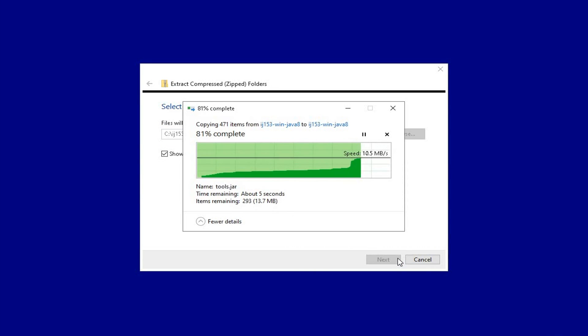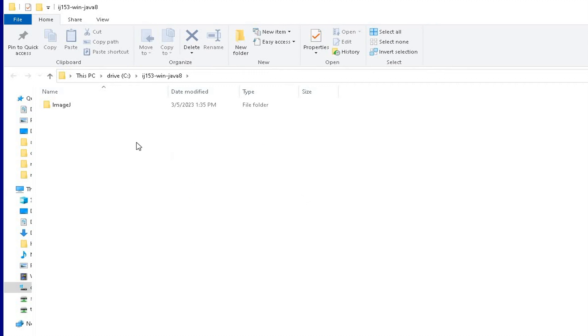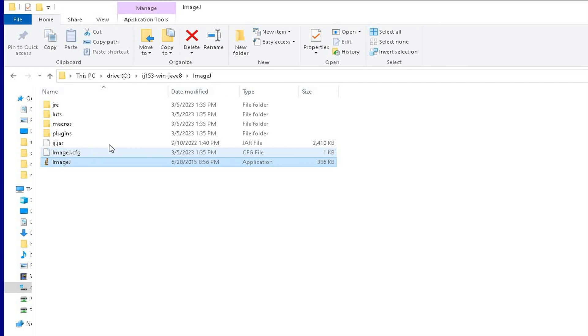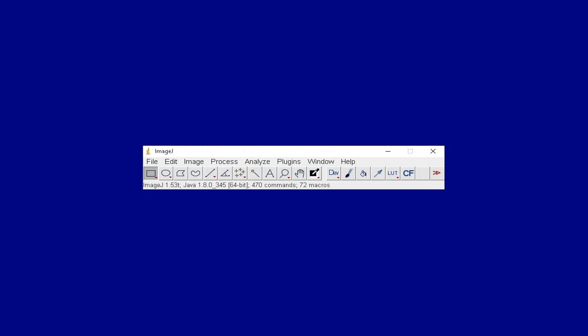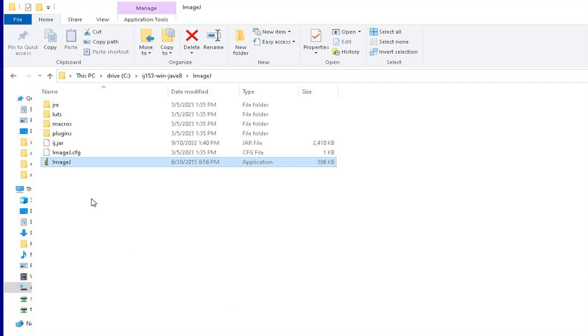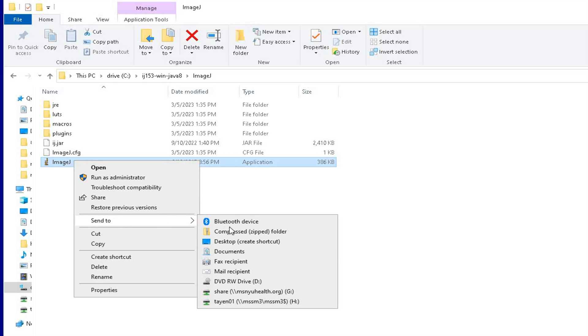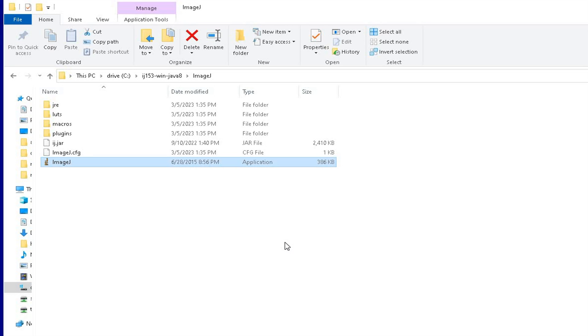Locate the extracted ImageJ file and head to the ImageJ icon. Double click on the icon and the ImageJ software will launch and it is ready to use. The ImageJ icon can be conveniently sent to the desktop as a shortcut for easy access.